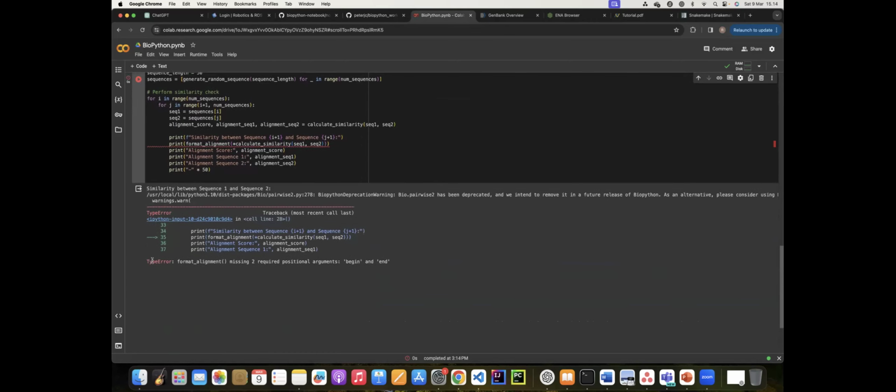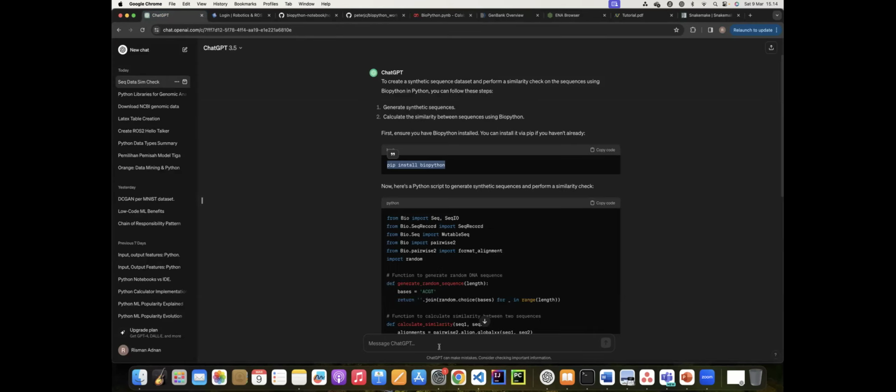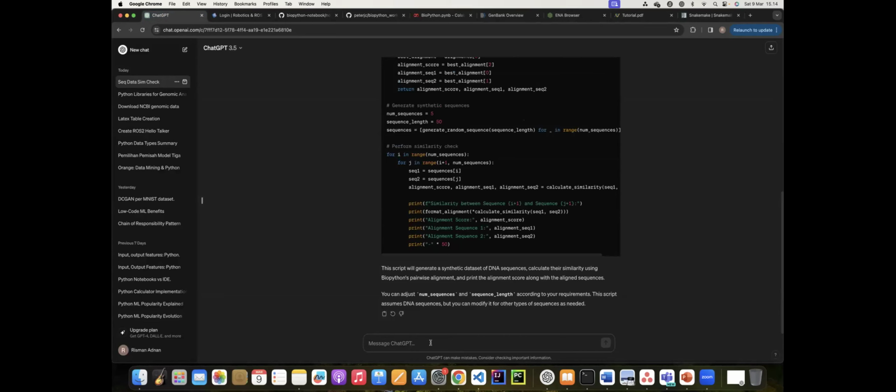Oops. Okay. Sometimes there's an error. It can be because of the version, or let's see.